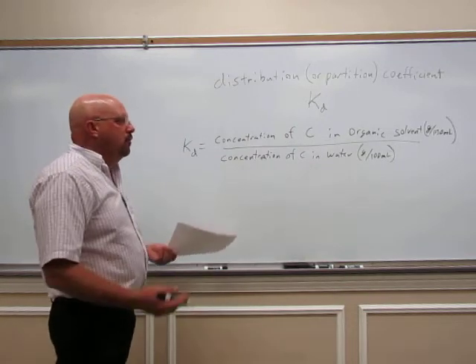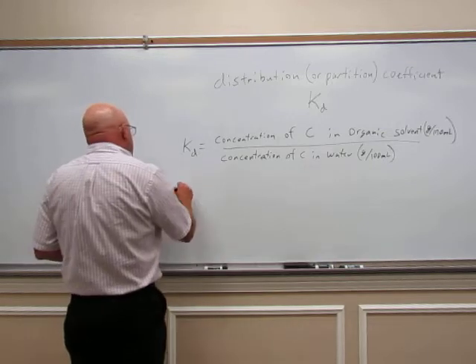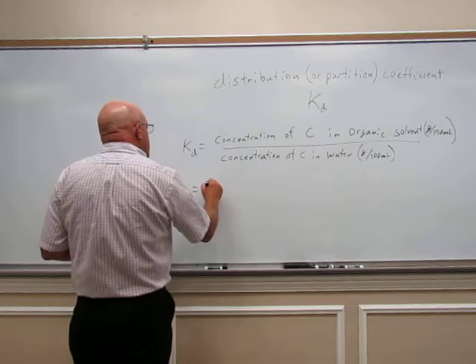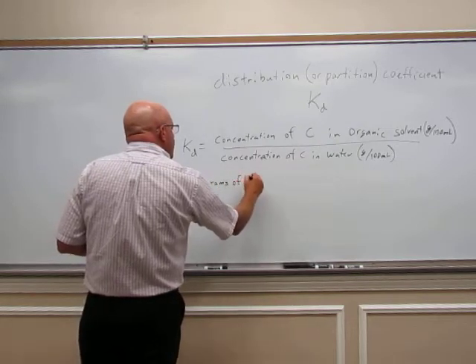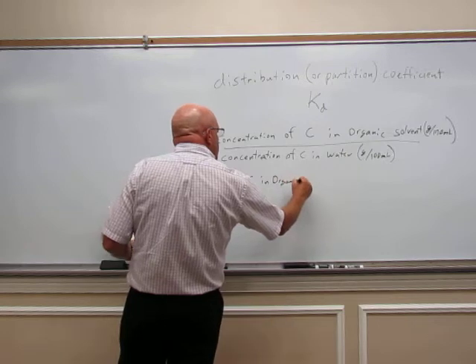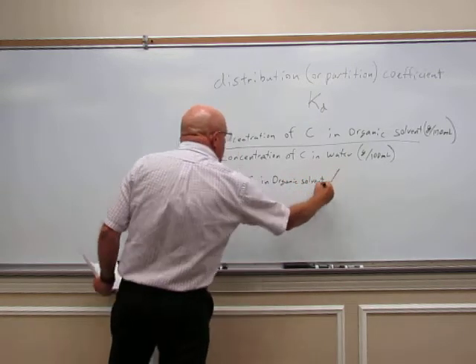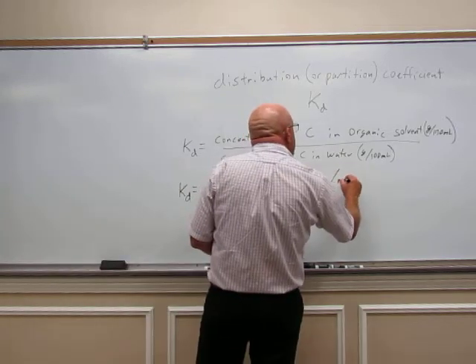Now, we're going to be using different amounts of solvent this week rather than the 100 milliliters. So let's rewrite this. We're going to look at grams of C in organic solvent divided by the milliliters of organic solvent.